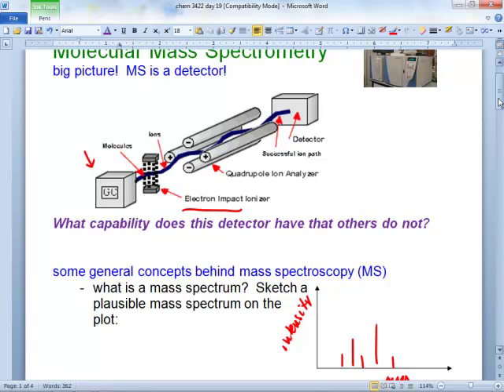That means it has to be in what phase? It has to be a gas, right? So it's pretty much that molecular weight limit story. For the GC, remember, roughly, you can't volatilize stuff over a certain molar mass. It's too heavy and decomposes on you.